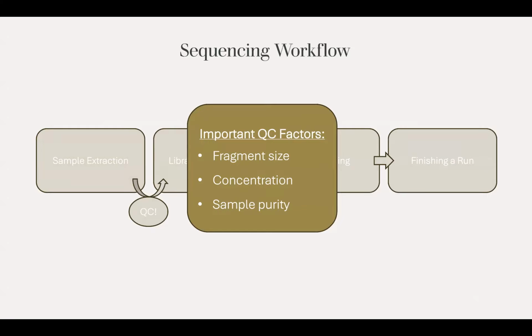I'll go over a couple instruments that I like to use for my quality control and my quality checking. All of these are available either through the Genomics Core or the SCIC. It's really easy to submit your sample for a relatively low cost if you'd like to check the quality of your sample. So first is the Qubit.